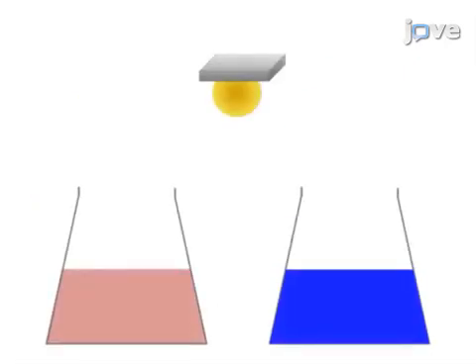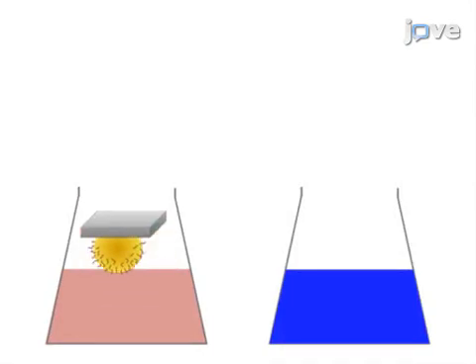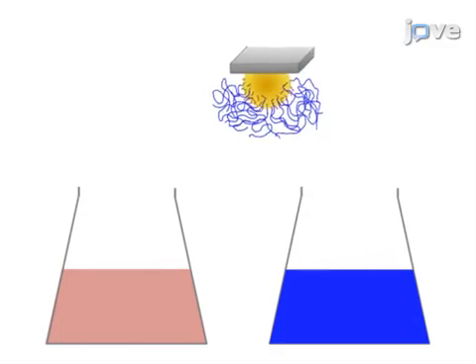As a second step, begin with a gold colloid attached to a silicon atomic force microscopy cantilever and graft PMMA onto it to make a force measurement probe. This will also form the second part of the polymer brush system.